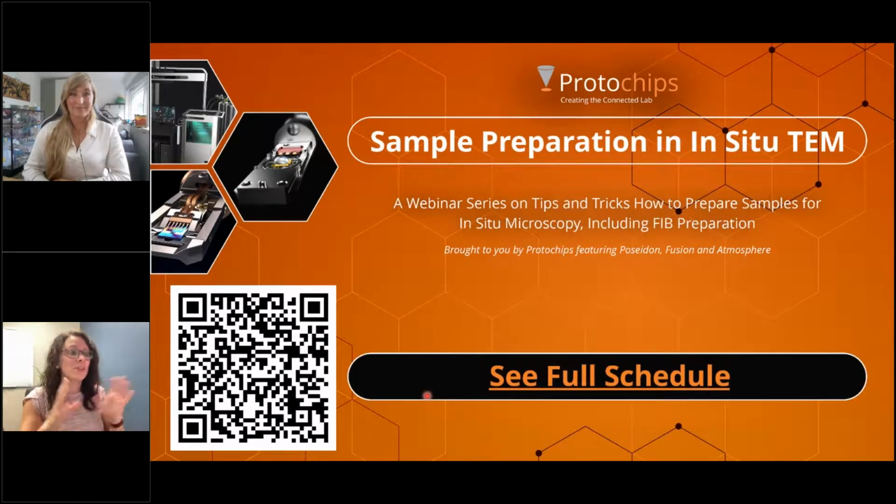There are a few questions related to plasma cleaning, so I'll start with those since they're related. Which gas for plasma cleaning do you recommend? Yeah, we usually use argon oxygen, but in principle it doesn't matter too much. Even with glow discharging, you'll be able to get a nicely plasma cleaned surface.